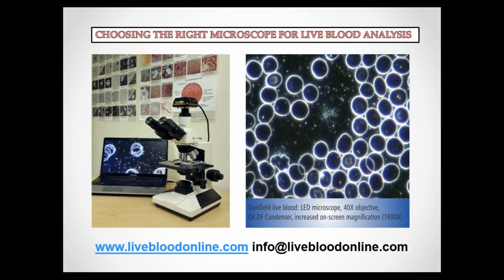Phase contrast is also a type of lighting system used in microscopy. That's a little bit more difficult to explain, but it makes use of the different refractive indexes of different items in a sample. Contrast is created in the sample from the interference of different path lengths of light going through the sample.